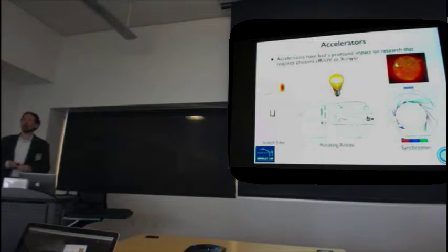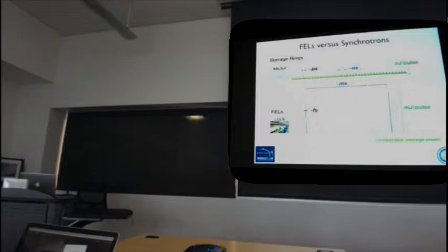And you're going to hear for the next 2 days all about FELs as a new source of light, of X-rays. And I'm not going to talk much about that really, but just to say that the fundamental difference between a storage ring, such as the new one being built in Brookhaven, and an FEL, such as the one across the bay at Stanford, is really how these photons are delivered.